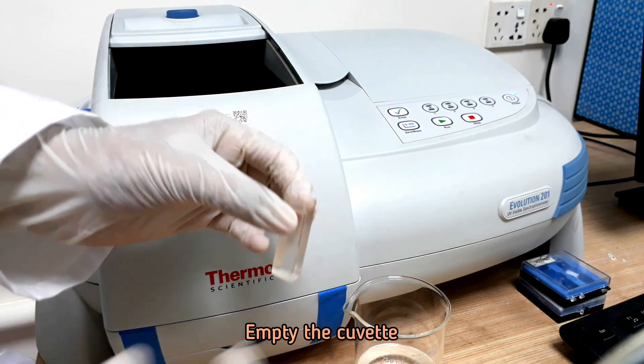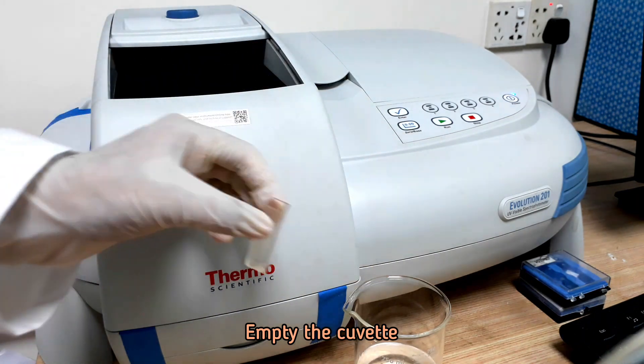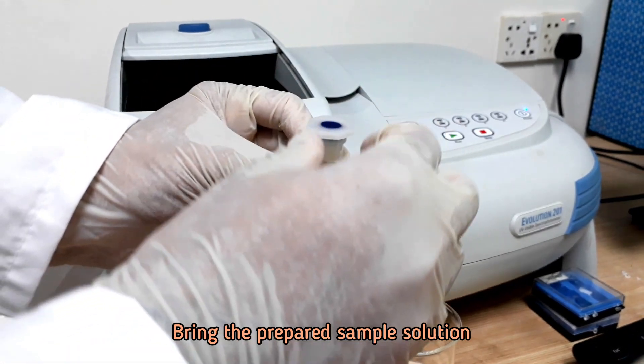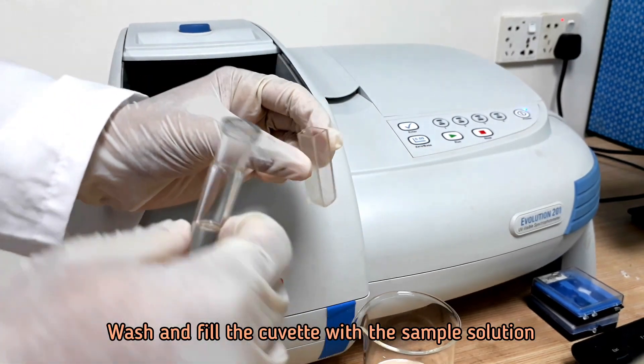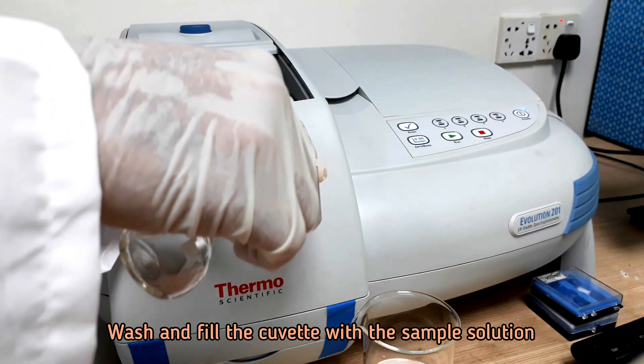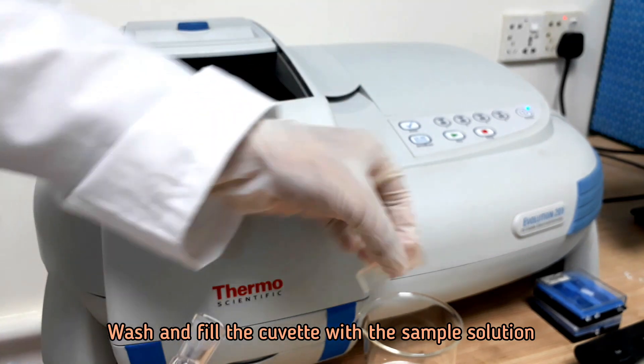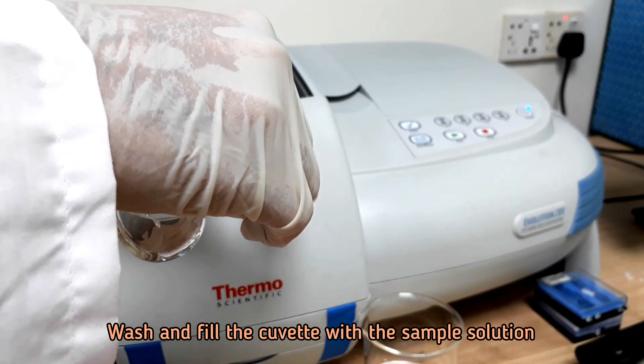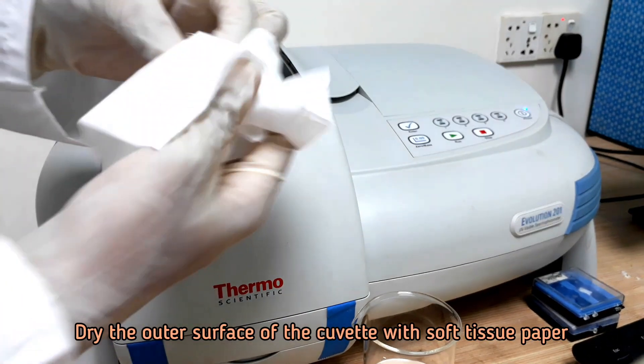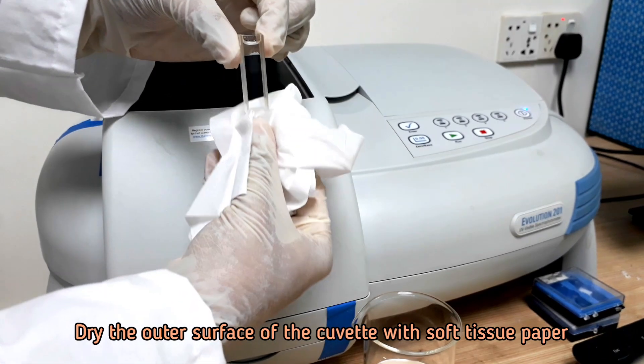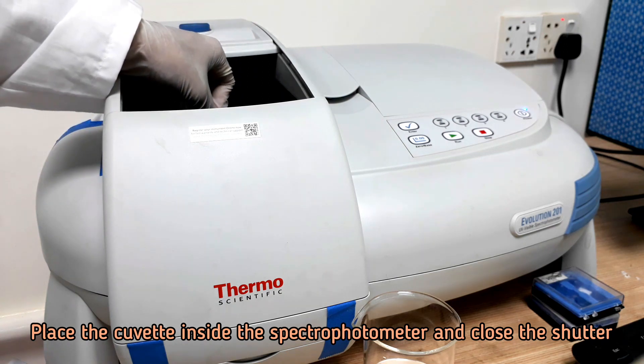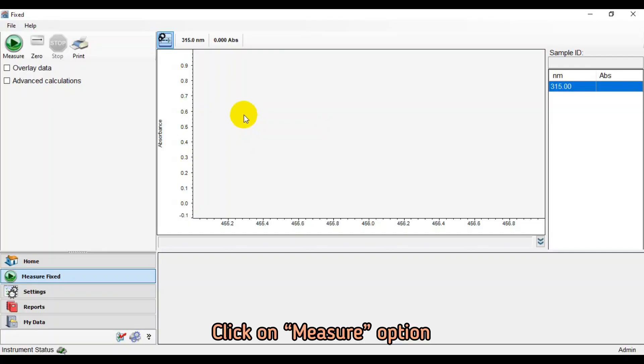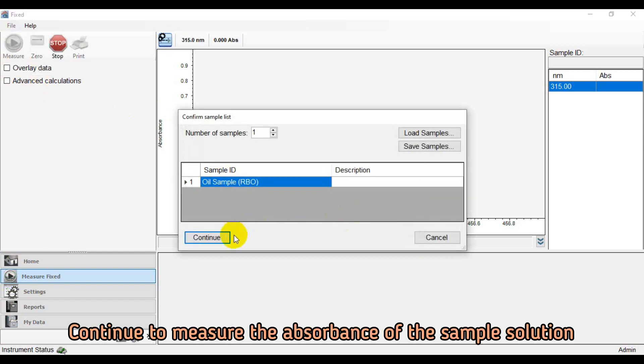Now empty the cuvette and bring the prepared sample solution. Wash and fill the cuvette with sample solution. Dry the outer surface of the cuvette with soft tissue paper. Click on Measure option and continue to measure the absorbance of the sample solution.